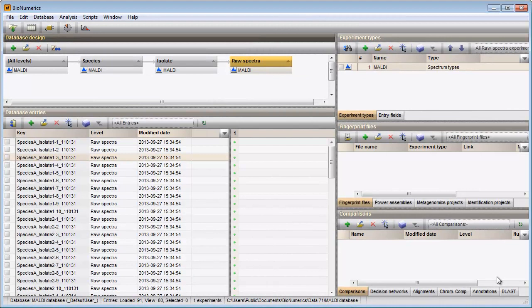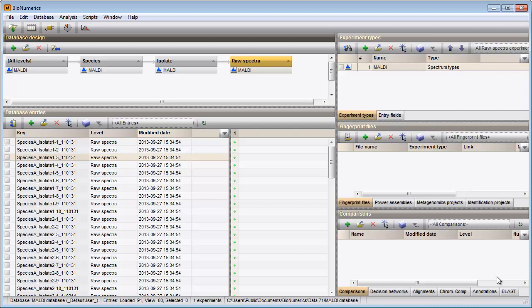In this video I will show how to summarize spectra in a Bionumerics 7 database. As you can see in the Database Design panel, three levels are present in my database.